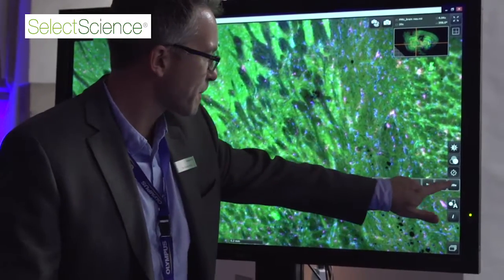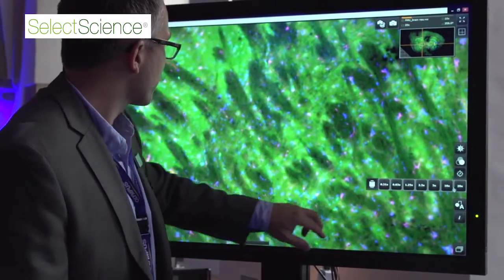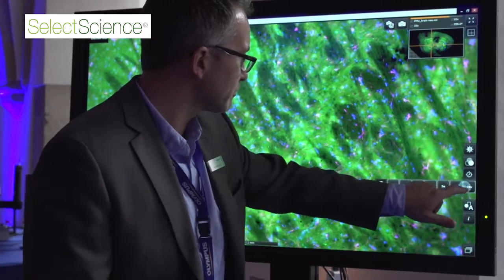We are doing a lot of development, and we also have a lot of light sheet imaging. So here you talk about large samples, very large samples. That means that you are not considering the cell culture, the cell itself or a part of the tissue, but the whole tissue or the whole organ or the whole animal itself. So it's much more interesting to get a large overview and to be able to describe it.